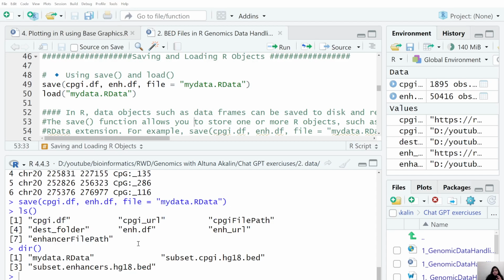This is the common misconception which I also ran through in my initial learning period: why I cannot see the R data that I have just saved and loaded. Okay.